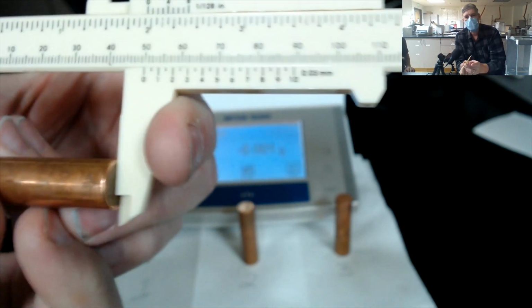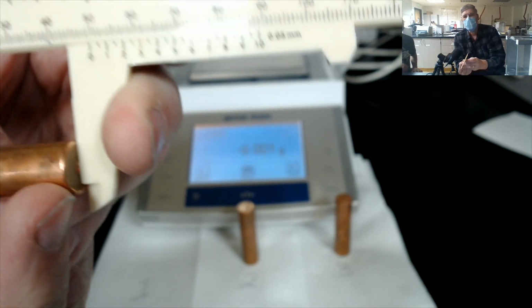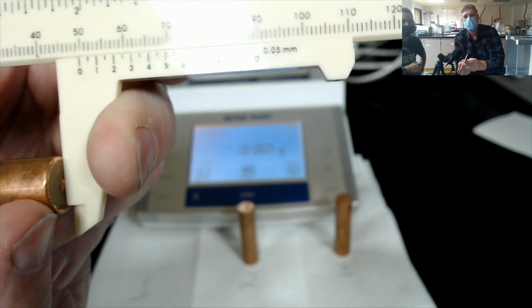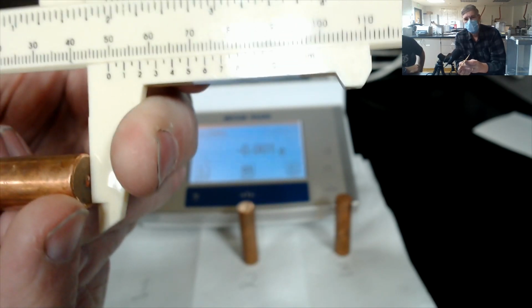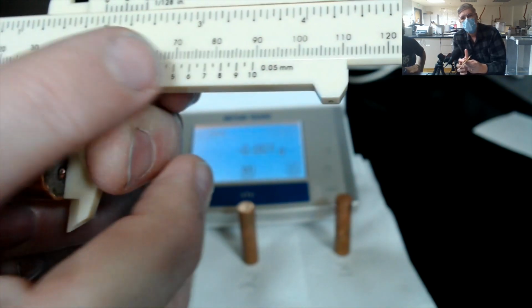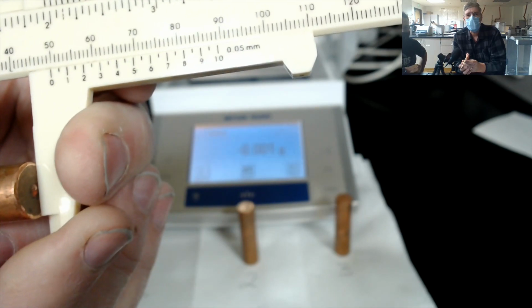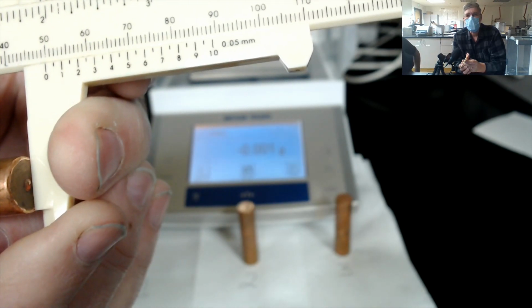First put the rod in, hold it tight, find our 0 point, and I will help on this one as well. And it looks like the 0 came between 49 and 50 millimeters, so 49 point something. And then again, we're going to look at the 20 lines. Try to find one that lines up straight across with the other side.